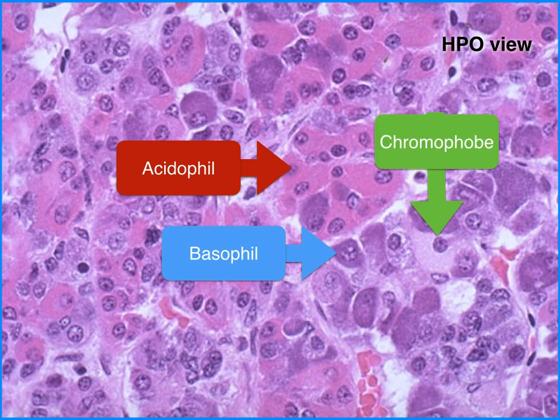Shown by the green arrow are the chromophobes. They are paler compared to both acidophils and basophils. They are cells that have degranulated their contents.